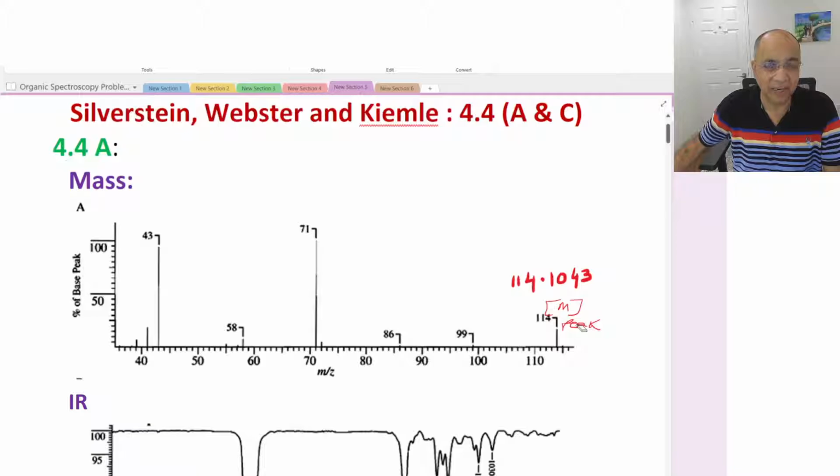And nowadays in mass spectrometer, we can get the M+ data with exact precision up to several places of decimal. And we have the data from the table from which we will tally which one best suits to this molecular mass. This only takes into account carbon, nitrogen, oxygen, and hydrogen.